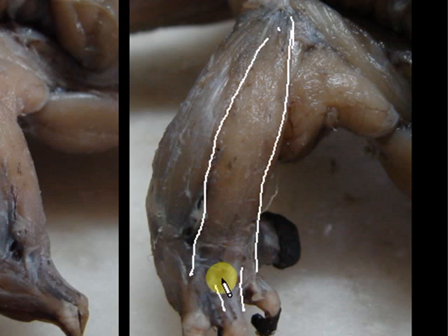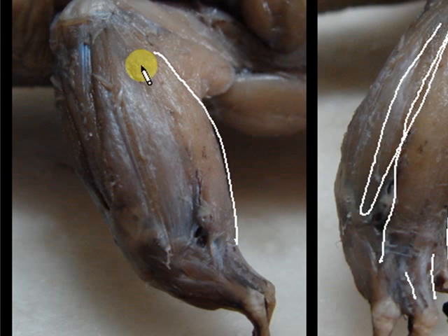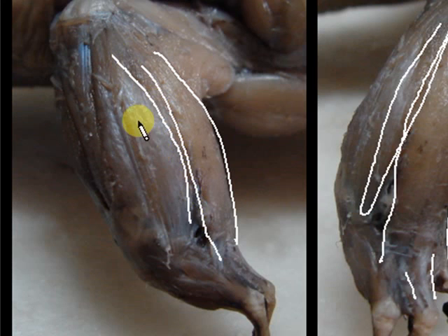Once you've found your extensor digitorum communis, look for the two other muscles next to it. On one side is the extensor carpi ulnaris, and on the other side of the extensor digitorum communis is the extensor carpi radialis. First look for the main muscle before you look at the minor muscles. From this view, the extensor digitorum communis longus is here, and this one is the extensor carpi ulnaris.